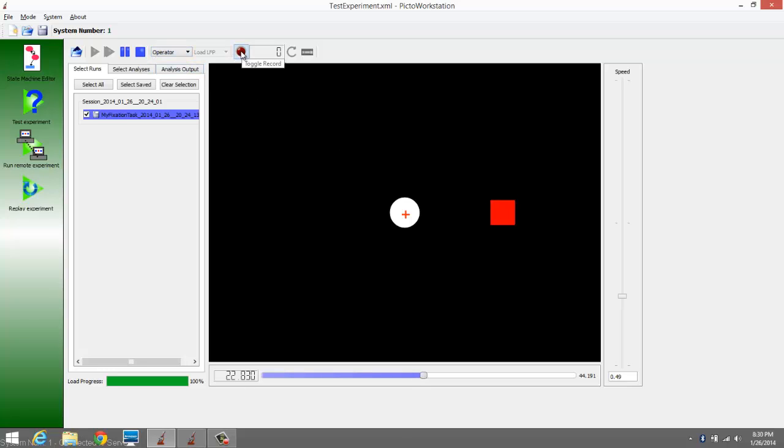Another really useful feature for presentations is you can press this toggle recording button. You see now this is the record time that's moving forward, and it's just recording exactly what we see on the screen. So if we move back up to real time, then it's going to start speeding things back up again. And say that's it, we're done, that's what we want to record.